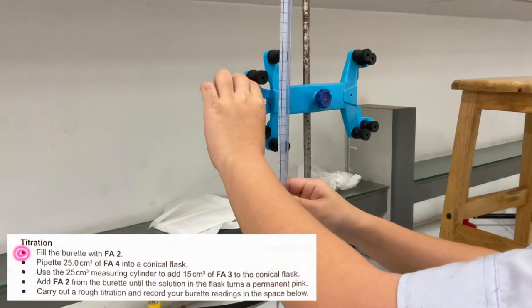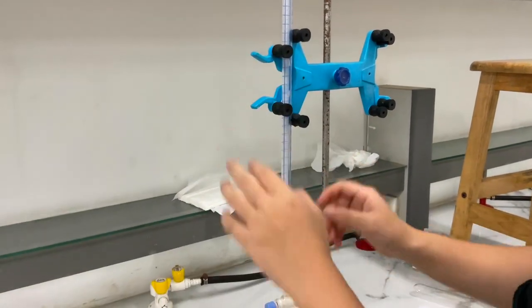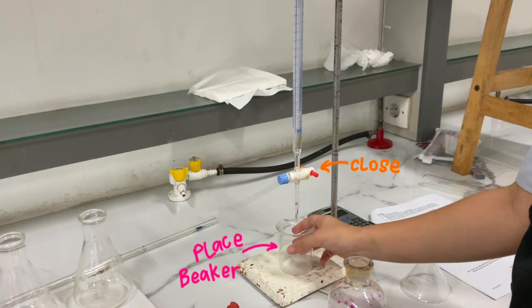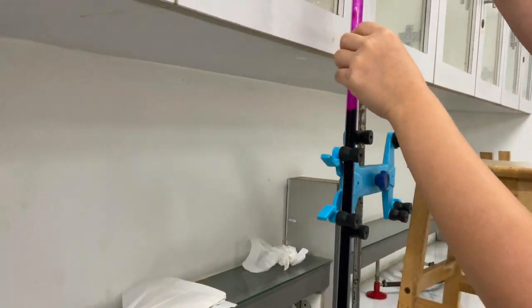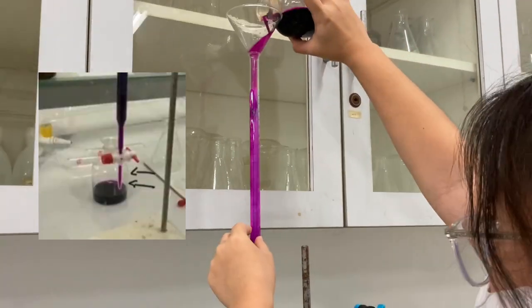The first step in titration is to fill the burette with FA2. When doing this, don't forget to close the burette, and you can also place a beaker below it to prevent spillage. For accurate titrations, the bottom of the burette should be filled as well.